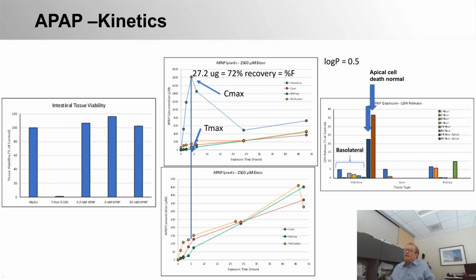Again, we see these nice lags. This is a single dose. The first example was a double dose. This is a single dose at time 0. And then lastly, we looked at some cytotoxicity at the end of the experiment.